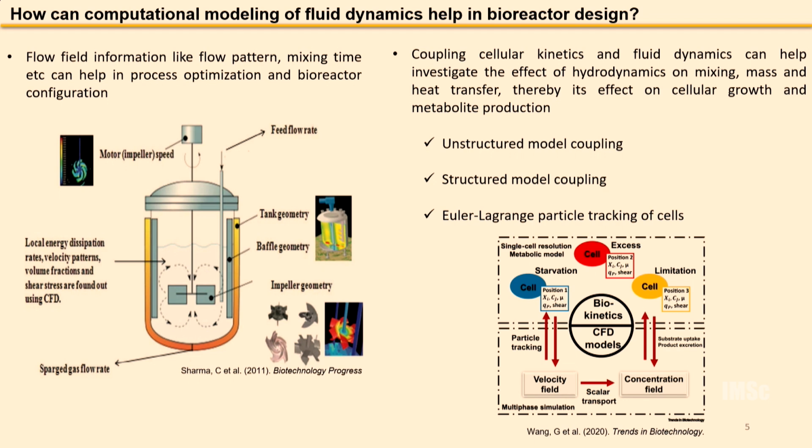And with that, there are different types of coupling, with respect to unstructured model coupling, and then the next step is to have a structured model coupling, as we can see in this figure. And there are also certain cases where the cells are considered as particles and they are tracked along the reactor to see how their behavior is with respect to the fluid.